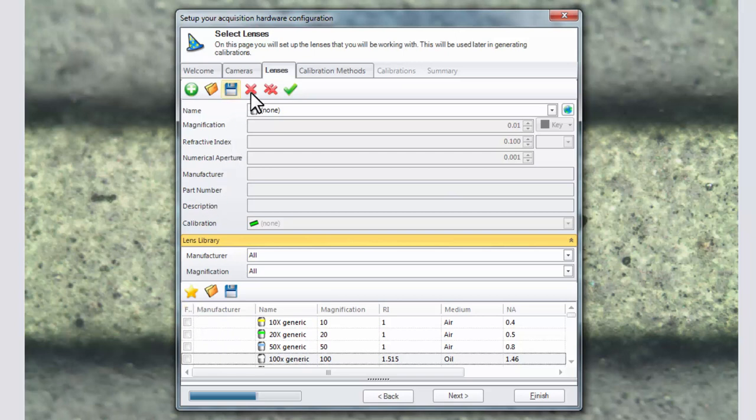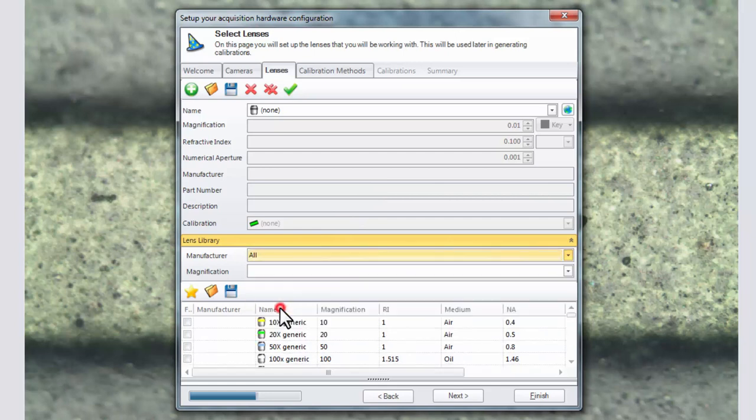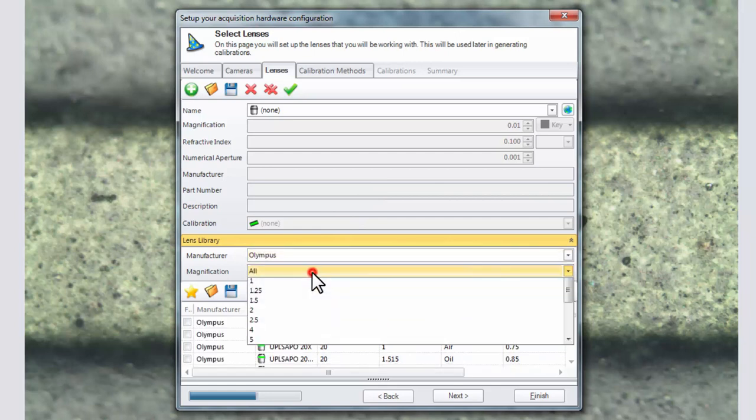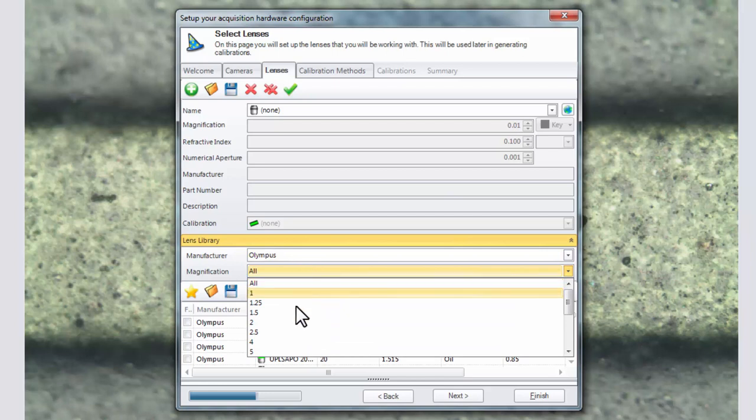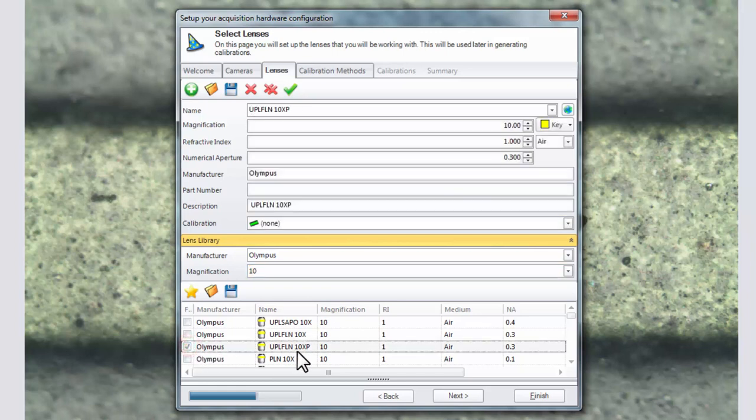Then either create a brand new lens or search for your lens in the lens library. Choose the manufacturer and the magnification of the lens that you have on your system. Then choose from the list of lenses available. Check the check box to add it as a favorite in the list above.